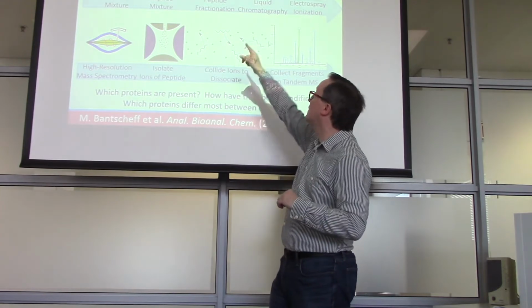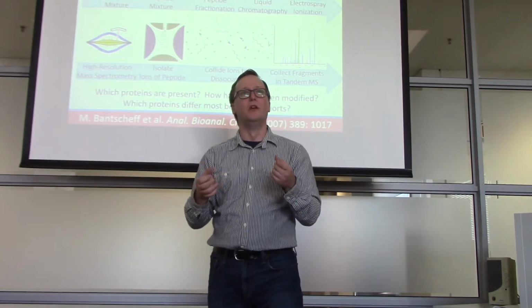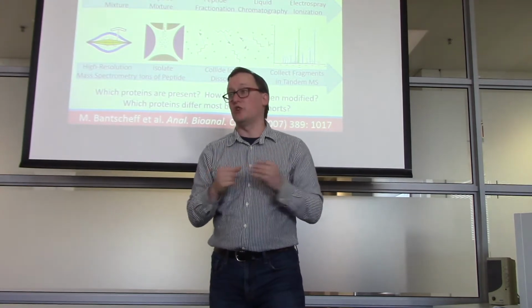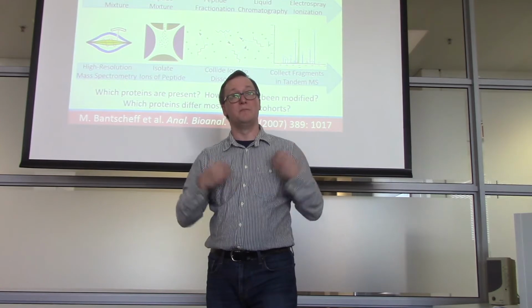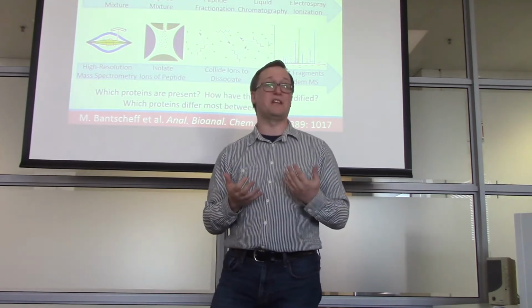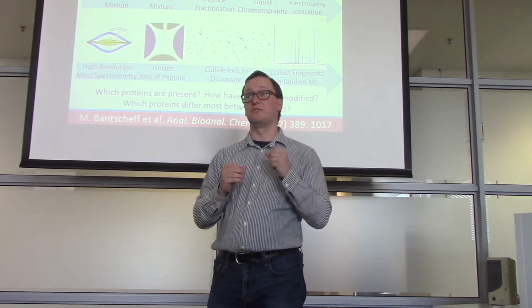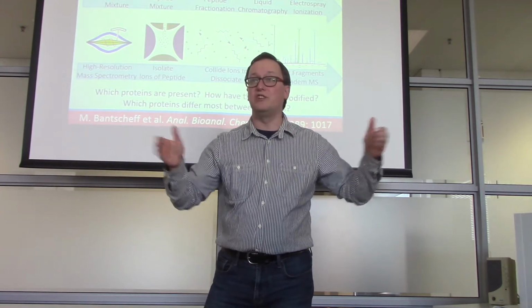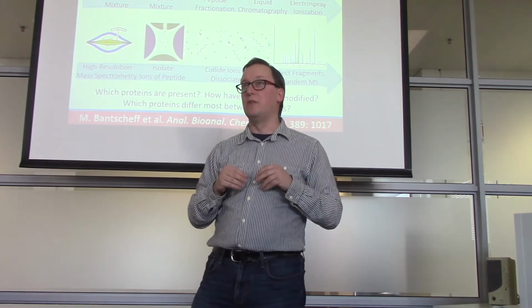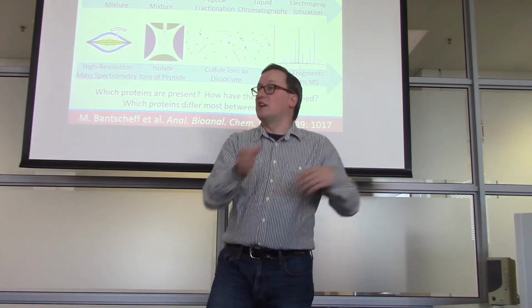of that sample. From there, for many samples as complex as a bit of human, we end up using fractionation. Now, fractionation is not used as frequently in South Africa because mass spectrometry feels like a very expensive technology. But in the rest of the world, you frequently find people making use of fractionation, maybe by separating proteins out in a 1D gel, maybe by using reverse phase separation at basic pH, maybe using isoelectric focusing.